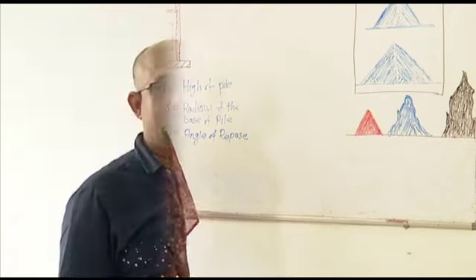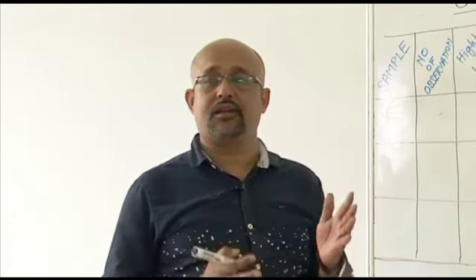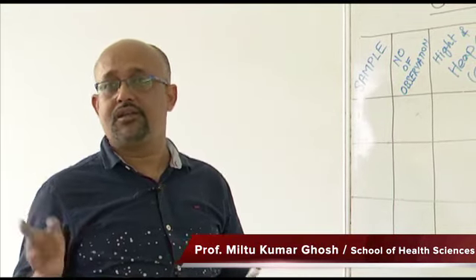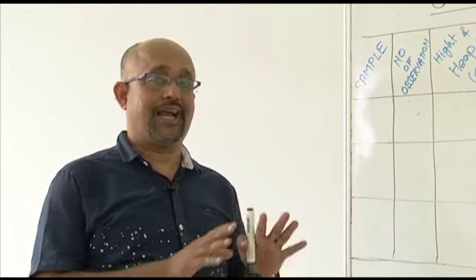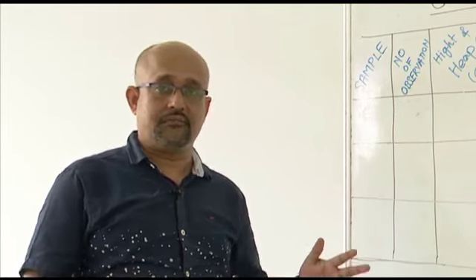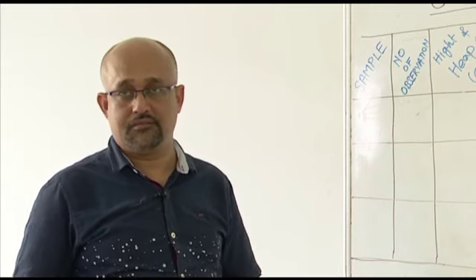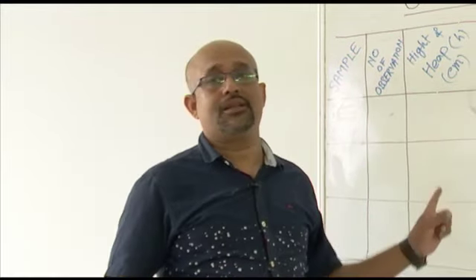So, after the experiment, you already have the idea of what the experiment is, what the procedure and method are, and you have already seen how it is done practically. So the next step is the observation part: what we have observed during that experiment. We will put that data in a table, and then we will calculate.